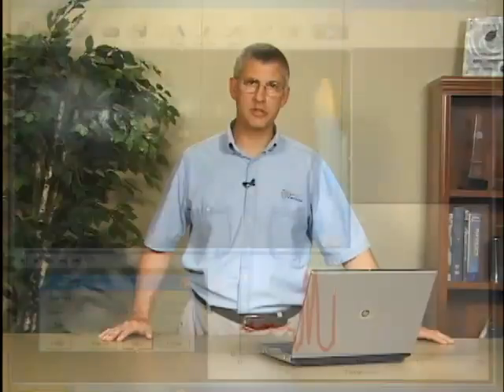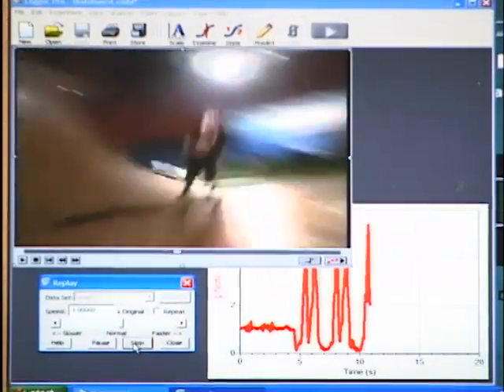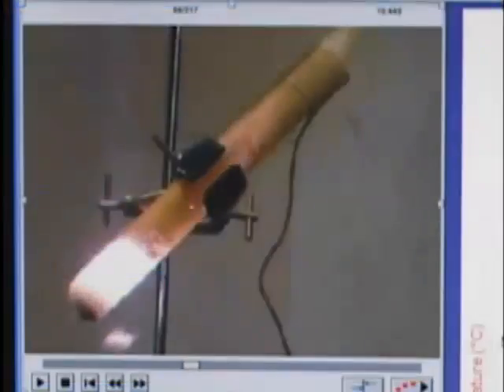In addition to sensor data collection, LoggerPro can also capture and display videos. Videos can be synced to sensor data to act as a powerful record of what happened in an experiment.